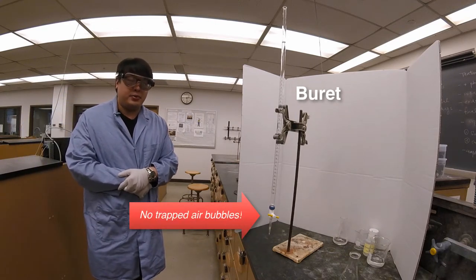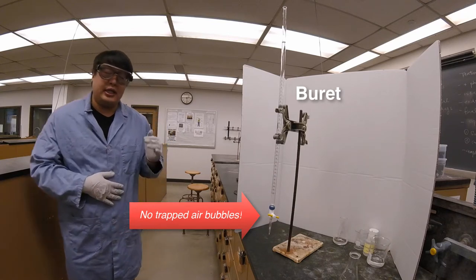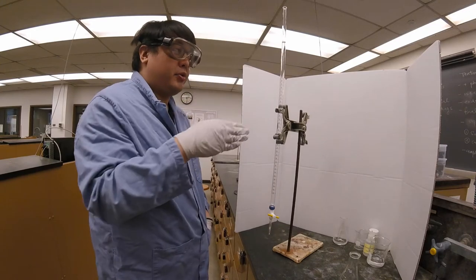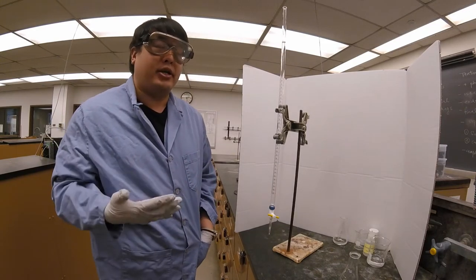When you read the volumetric buret, it's really important you want to take the initial volume. And when you look at the volumetric buret, you'll notice that there are major and minor tick lines.